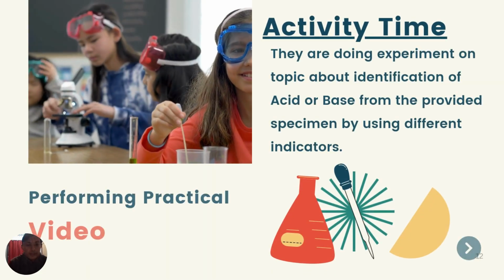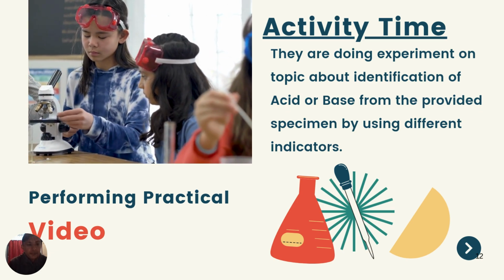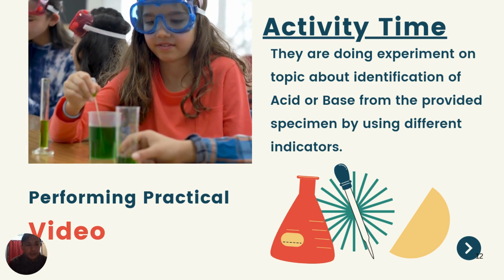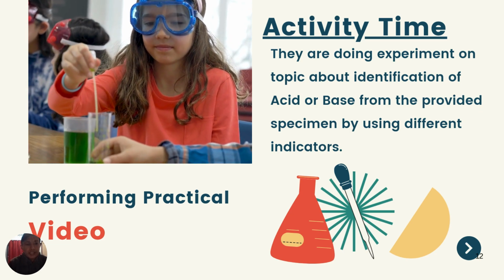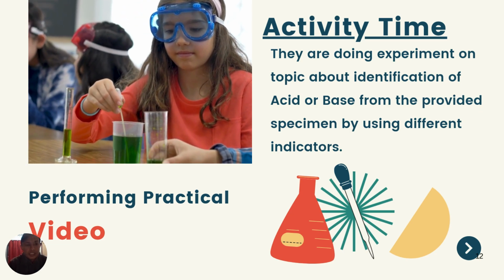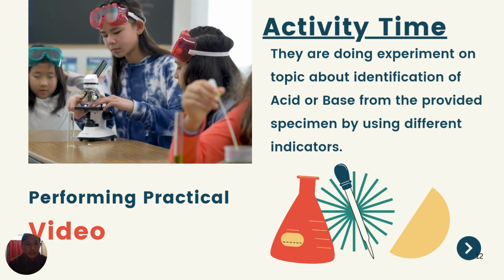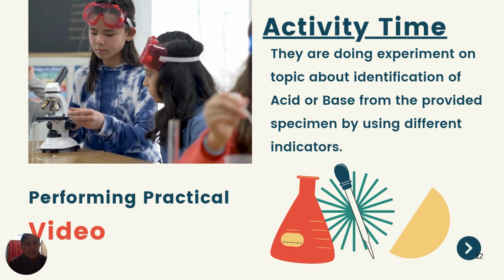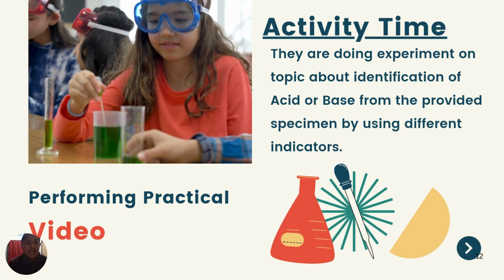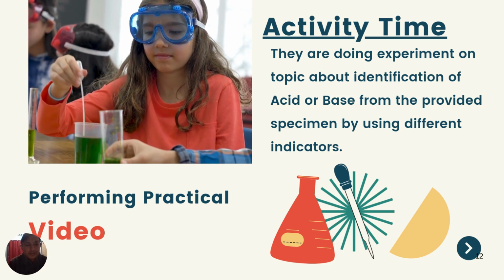Now here is some activity. We watch different things, and we use phenolphthalein indicator and litmus paper indicator. We test whether our sample is acid or base, and we can identify it nicely from this activity too. I hope you enjoyed this activity too.